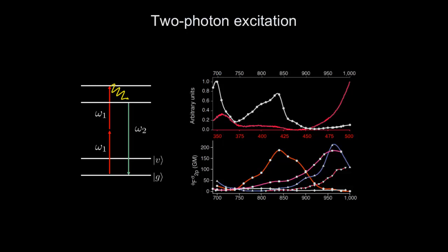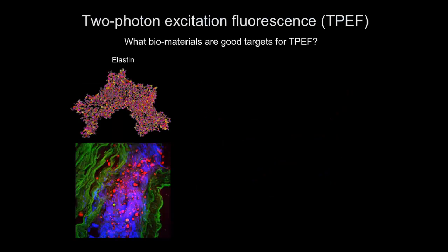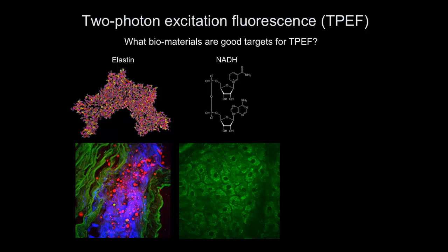I don't have the labels, but there's NADH in there, riboflavins, elastin. Those are typical examples of molecules in tissues that contribute to a strong 2 photon fluorescence. An example is elastin. It is a structural protein, indicated here in green. Beautiful fluorescence. A structural protein, essential in tissue and connective tissue. It fluoresces and can be excited very well through a 2 photon fluorescence process.